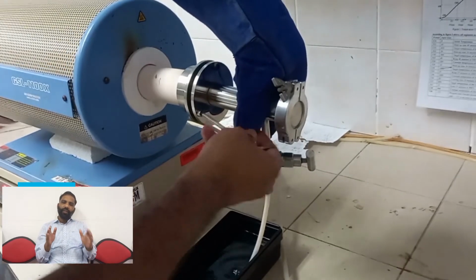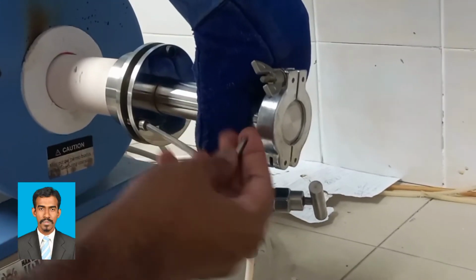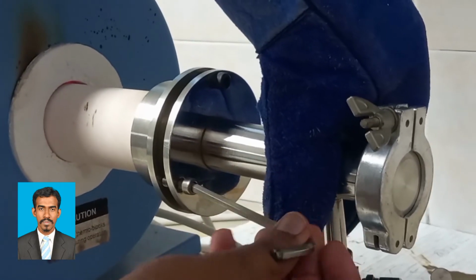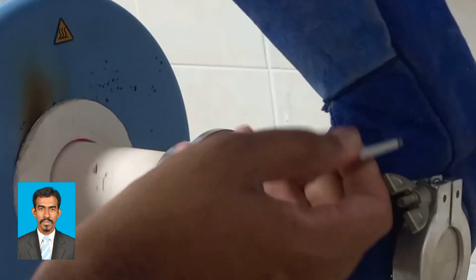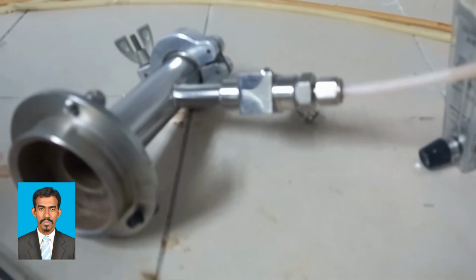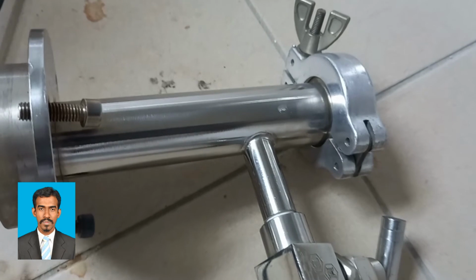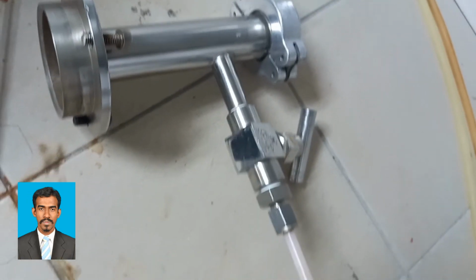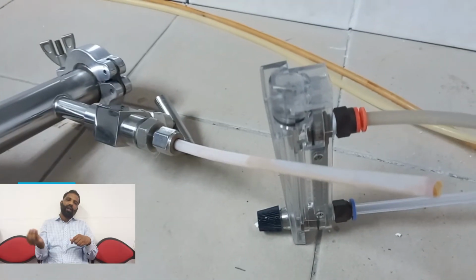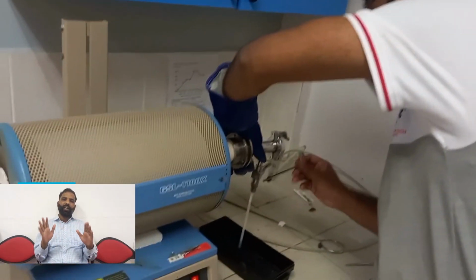Then you will open the argon furnace with the help of a screw, put in the ceramic boat where the nickel titanium arch wires are, and tighten it again. So for 20 minutes it is heated.